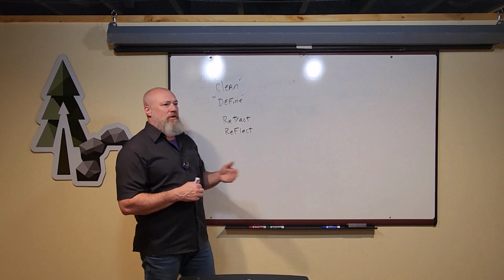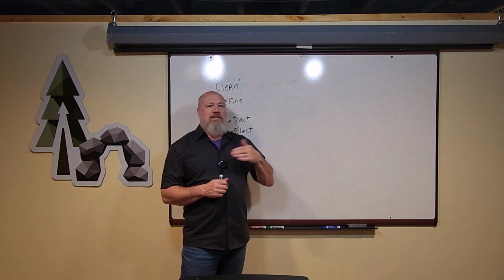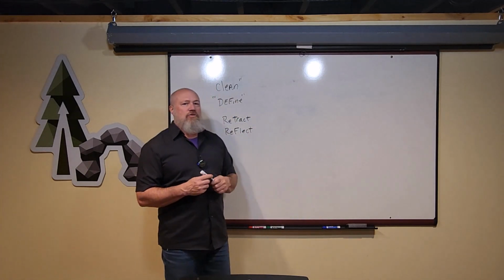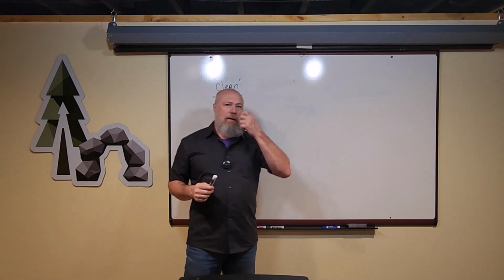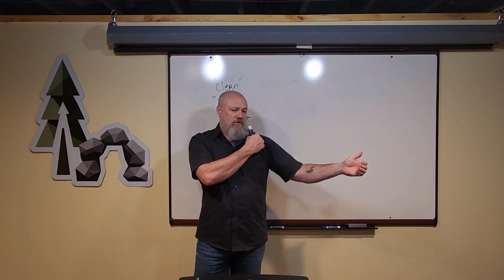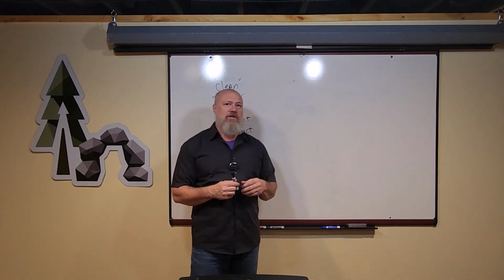Reflect means you're going to fold that structure out of the way along its cut line, cut edge, through its transection. So if I say reflect the pec major medially, I'm going to have you make a transection somewhere in the muscle, and then you're going to reflect it by folding it in a medial direction.